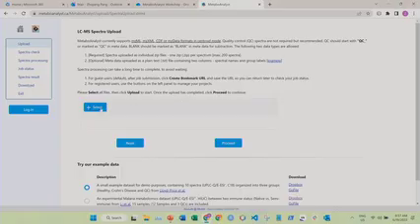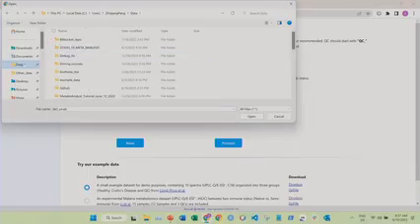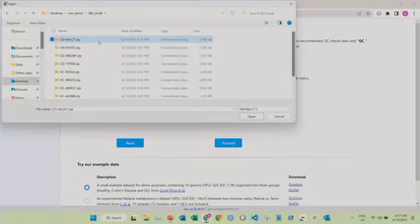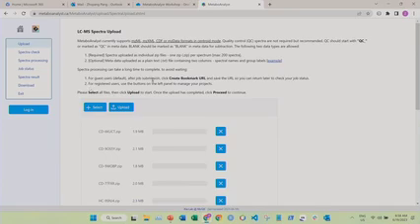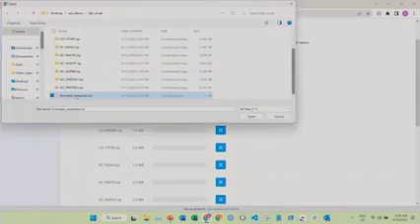You can select your data from here. For example, the most commonly used approach is to zip our raw data files into a single zip file. Here we have 10 files, so we zip them into one file. We can select all of them. This is the file, and we can also select a metadata file. This file is used to describe the group information for our data.